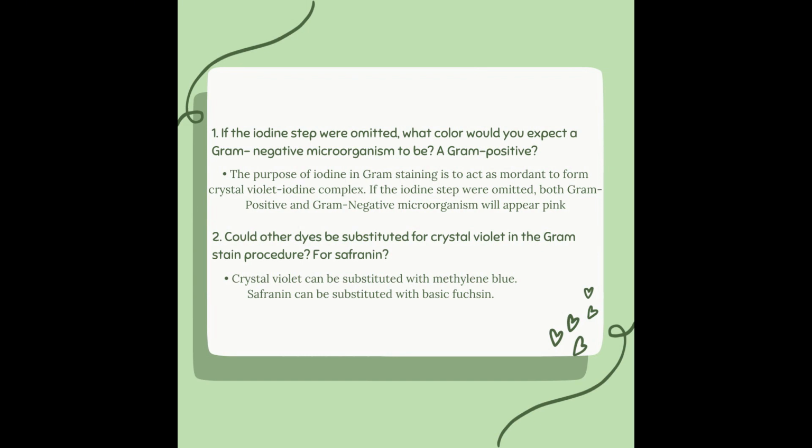Question number 2. Could other dyes be substituted for crystal violet in the gram stain procedure? Crystal violet can be substituted with methylene blue. Safranin can be substituted with basic fuchsin.